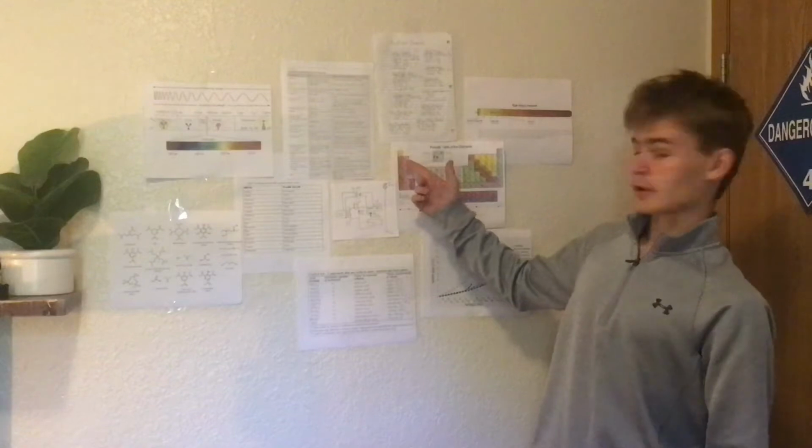Now in this series, I'll be performing reactions and experiments with different elements from the periodic table. So anyways, the element for this episode is lithium. Now what is lithium, you might ask? Well, lithium is the third element on the periodic table.